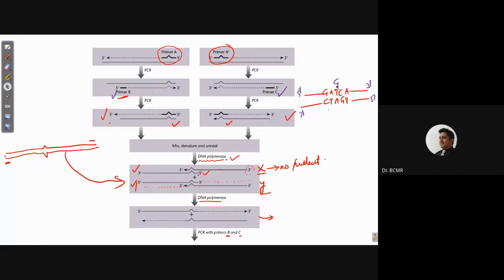So in this case, if I have to design a primer, there'll be some homology sequence that is complementary to this. And I should have added G, A, T here, where the original sequence is T, but I have to change it to C, right? So I need to put G in here, and C and A. The rest of the sequence is matching, except there is only one position that is not matching the original. I am incorporating the mutation here like this.